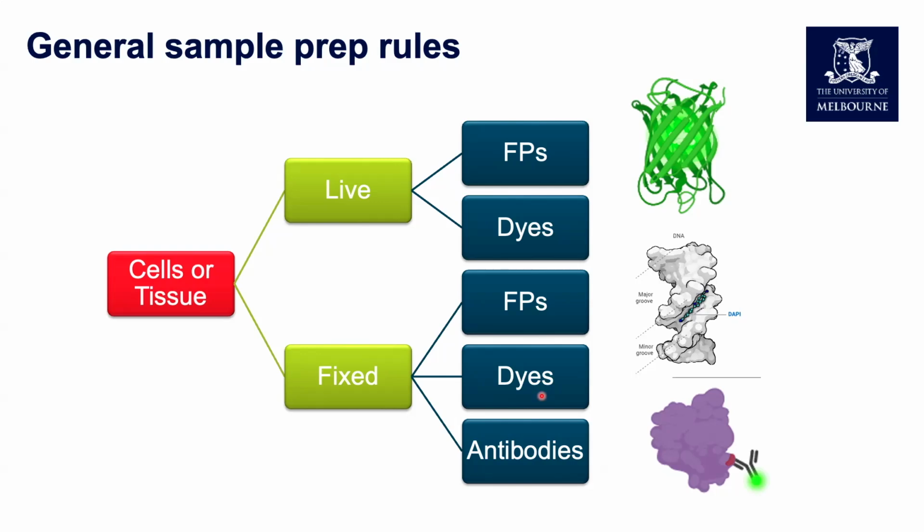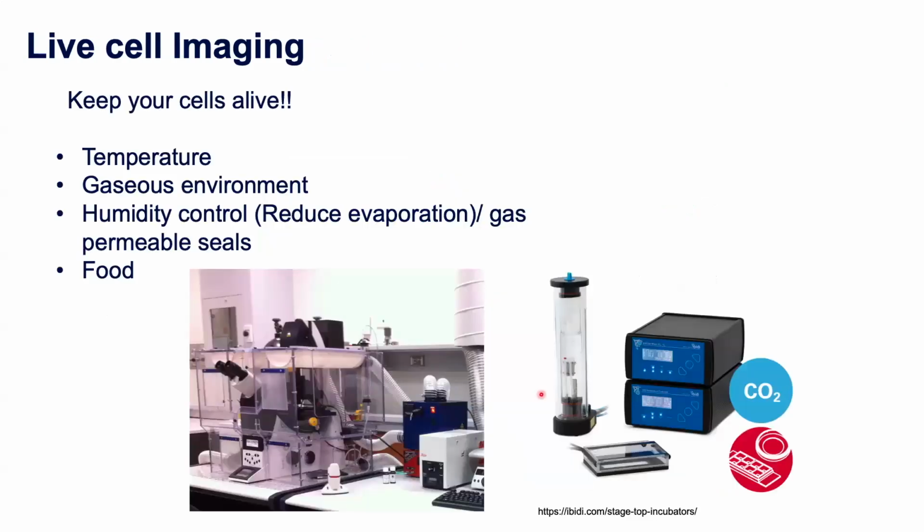While we're discussing live cell imaging, another thing to take into account is that you need to keep your cells alive throughout your imaging experiments. Sometimes we hear people say that they tried to do a live cell experiment, but by the end, all of the media had disappeared. Obviously, your cells are not going to be happy well before the media has disappeared.